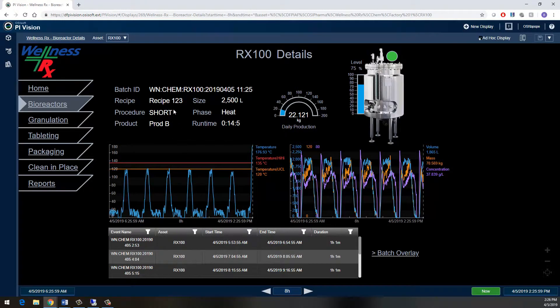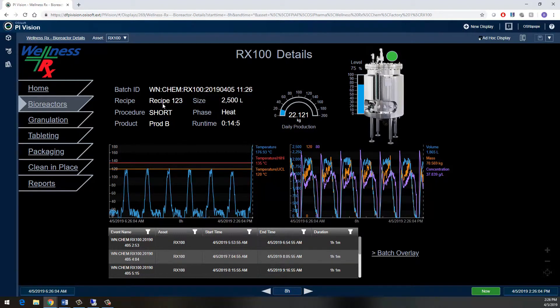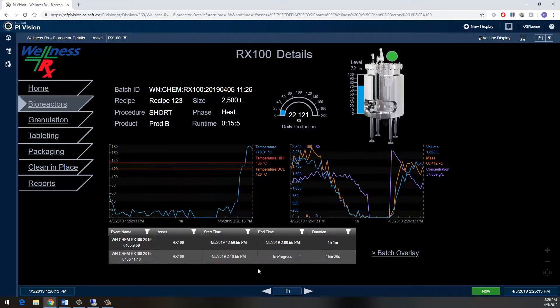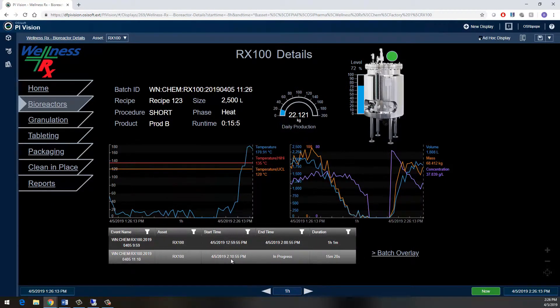From this display I can see information like my batch ID and my current recipe. I have trends of my critical process parameters along with some control limits, and I can clearly see that my temperature is going up above the upper control limit. Down at the bottom I have a table with my most recently running batches.